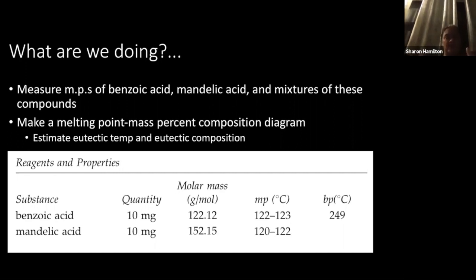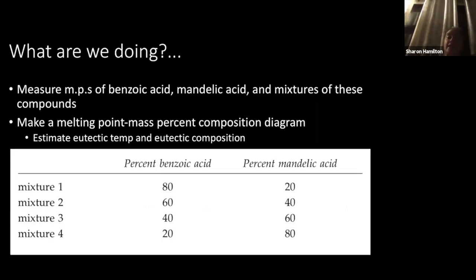Likewise, you're going to be analyzing mixtures of these compounds. The mixtures are already pre-made. They may be labeled mixtures 1, 2, 3, and 4, and if so, these are the compositions. However, HAREL tends to traditionally label what the percent ratio is. So you may see labels on the mixtures with 80-20 or 8-2 or 4-1. And all of those would be describing mixture 1.